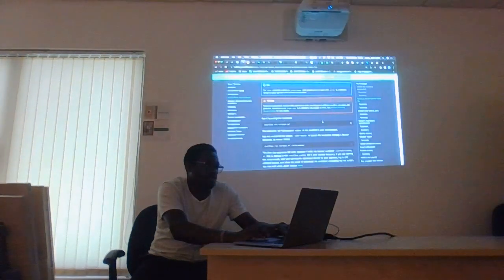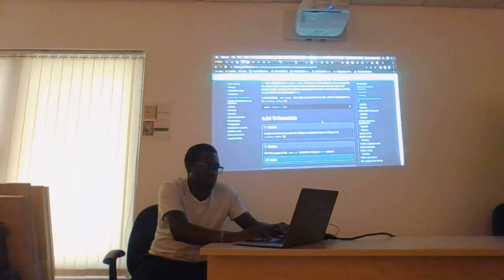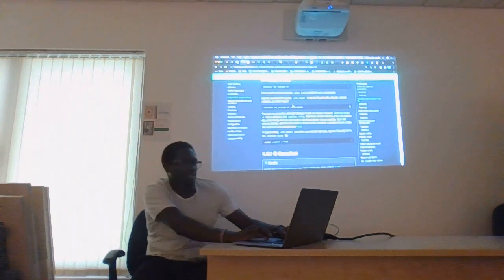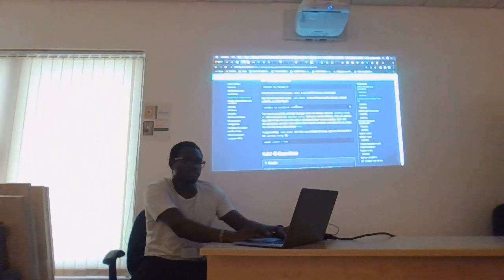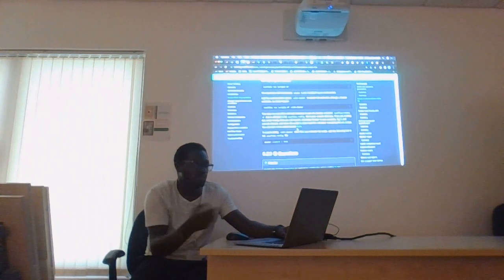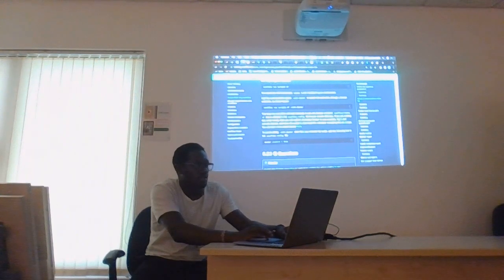Now when it comes to the other step, which was a bit of a problem, alternatively you could run it using Docker, as I mentioned previously, which will launch the Docker container. I guess probably these guys have already built a Docker image for this particular workflow, which you can easily pull and run to execute the commands.